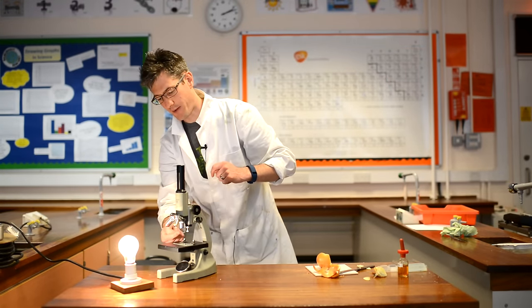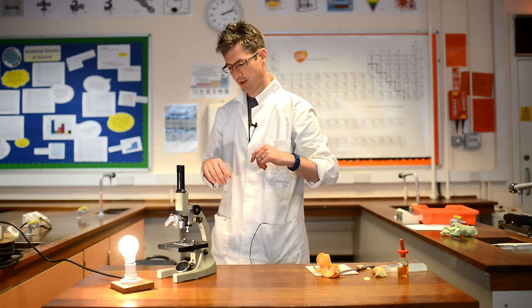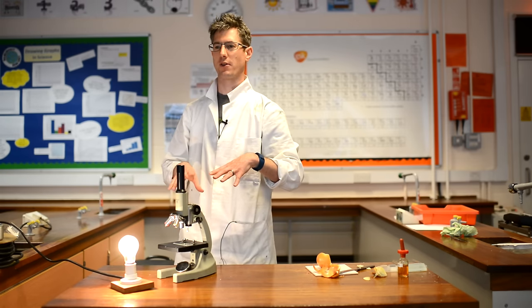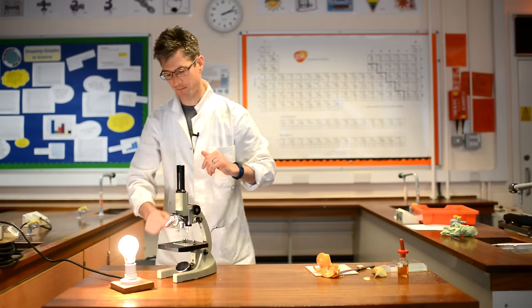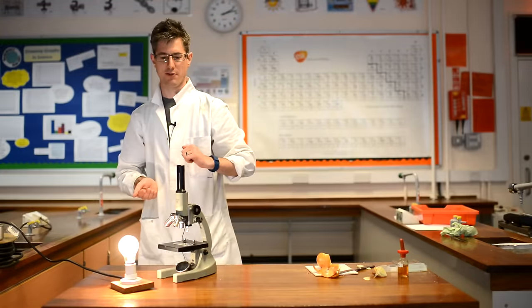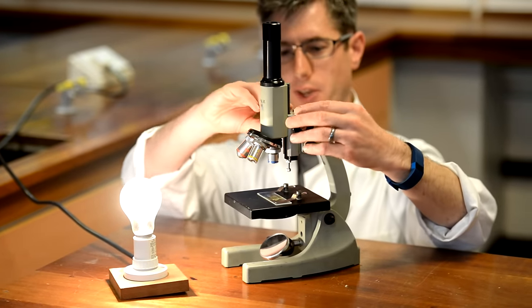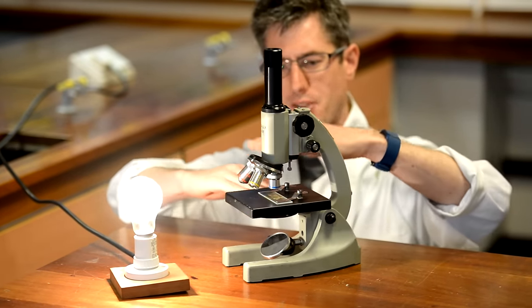We now have light coming up through the specimen that is on the microscope stage. This is the point that people find most difficult and very frustrating when they cannot focus properly on a specimen. So here are the tips you should always run through if you cannot focus: Step one, make sure you're on the lowest magnification lens — our times 4 objective lens. Step two, get the stage and that lens as close together as possible. It is good practice to get low down whenever you are moving the stage and lens — these large dials are called the coarse focus dials.